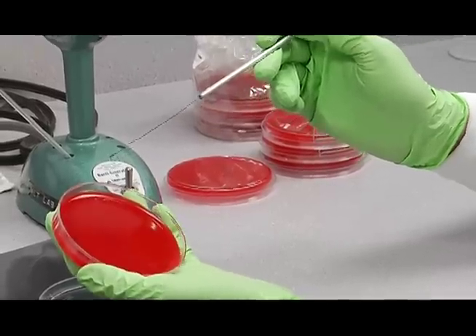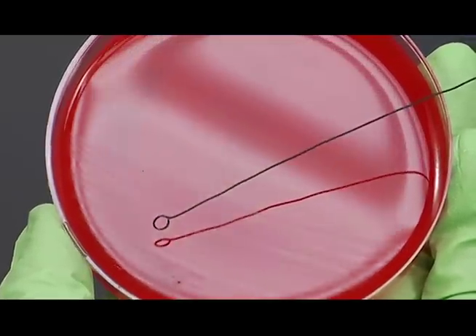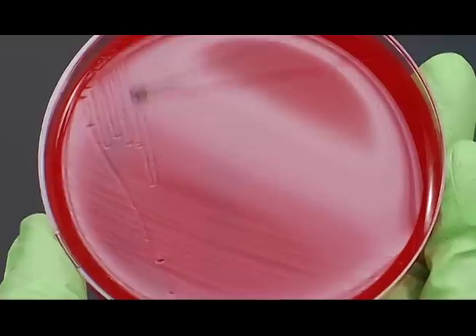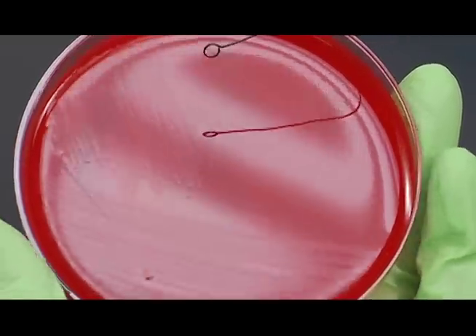Then you're going to flip it over to the sterile side, or you can reflame. With that edge, streak out into this corner at this angle — nice tight streaks all the way out to the edge of the plate, but not into the previous area.